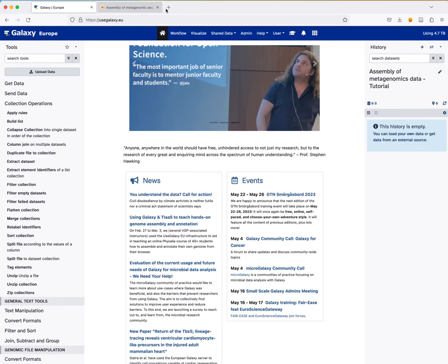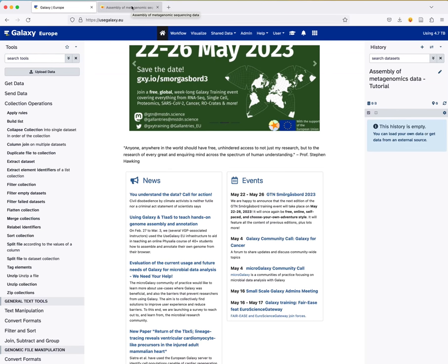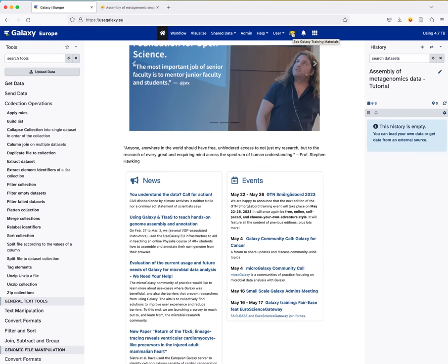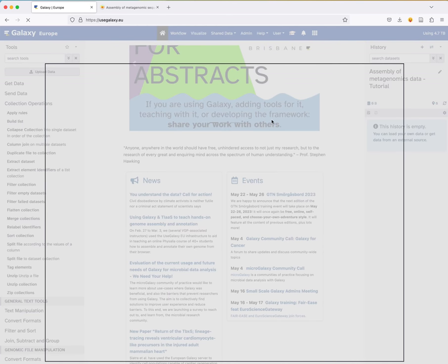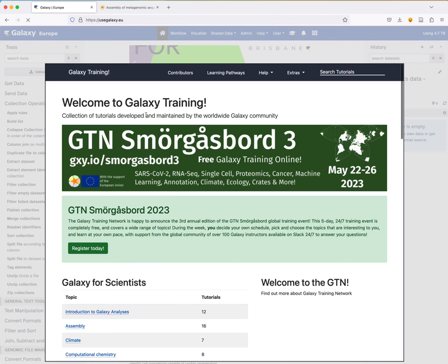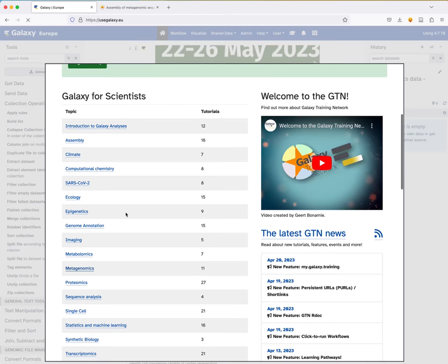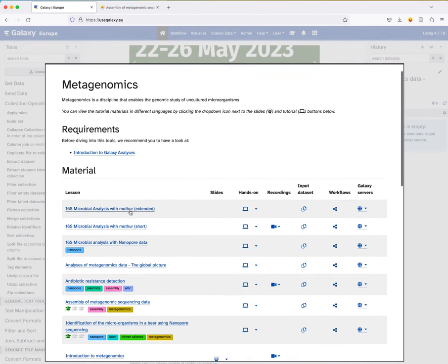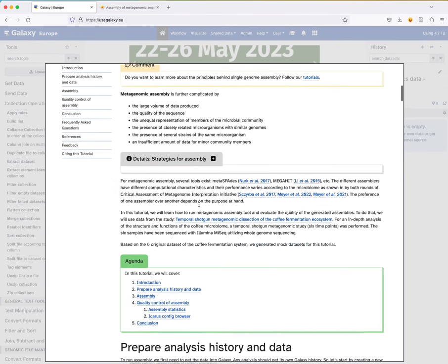Instead of switching between tabs, I'll use the icon in the Galaxy interface to see Galaxy training materials directly embedded in Galaxy. You can find all the tutorials from the GTN right here. It makes it easier to follow along without switching between windows. So I'll navigate to the assembly tutorial here.